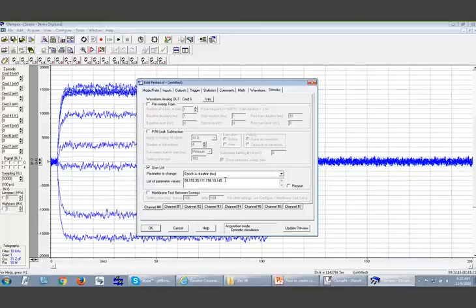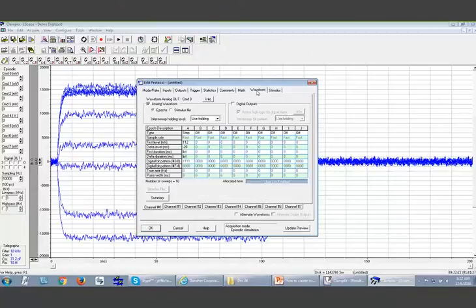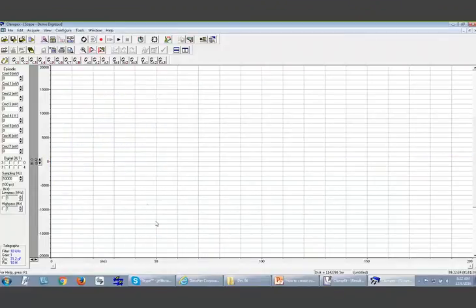All right, so I think we can do something here. Then look at the waveform tab. Now you see the duration is under the list. Let me delete this one and just put 0 here. Then let's hit OK. Then you can run it.